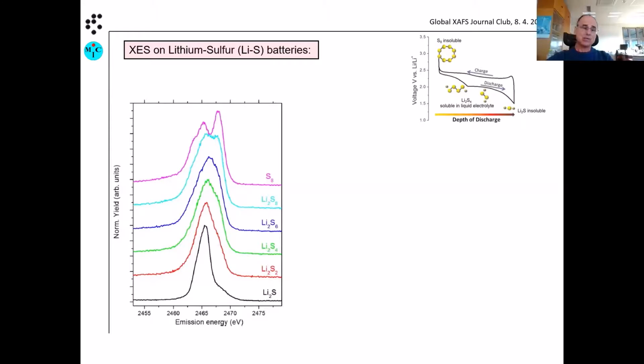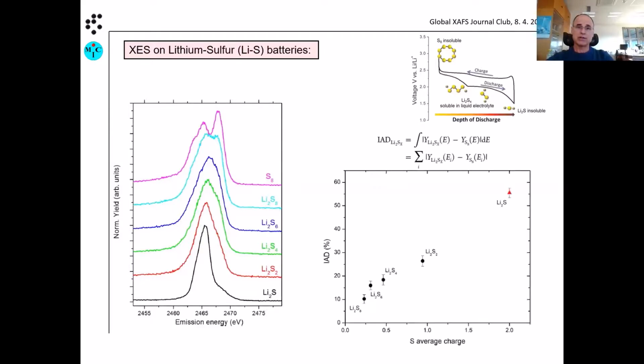But now we were thinking how to proceed, and then finally we decided to go with a simple empirical approach. So I plotted here this quantity, which has been borrowed from the people doing 3D transition metals emission. They used it to determine the spin state.